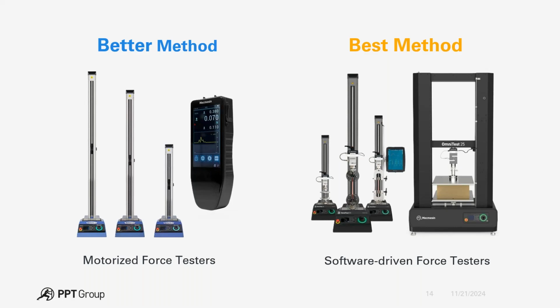So essentially, in a software-driven testing environment, you have some variability and versatility in how you approach your tests, especially in cases where you'd like to apply all three test types, whether you're running to a displacement measuring force, or applying a specific force measuring deflection, or just running until sample failure and then measuring both peak force and peak displacement. You can configure all three tests easily.